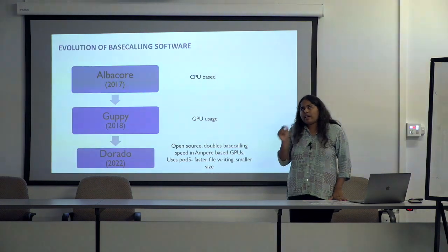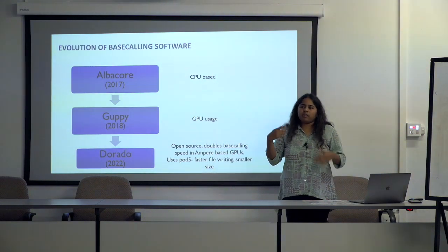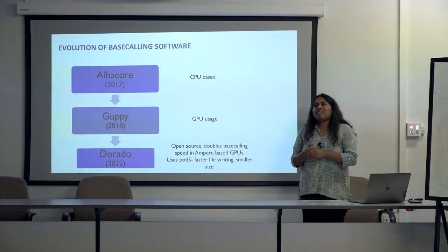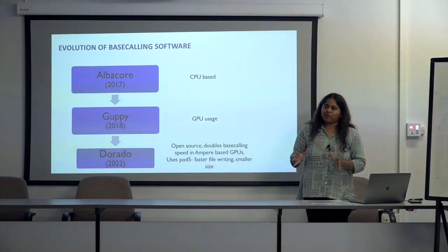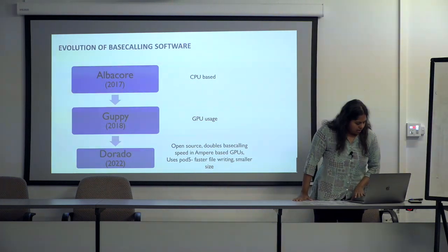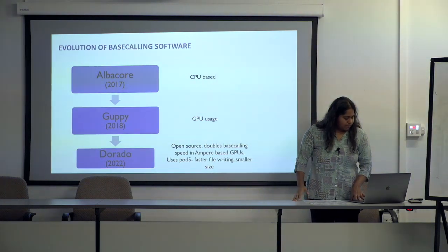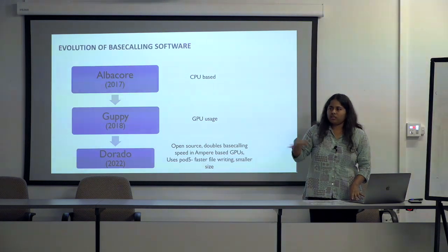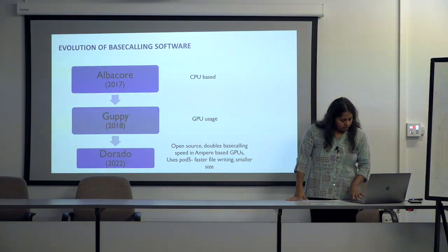The main challenge we had was that a CUDA driver needed to be upgraded. So if you've bought the right computer and things are not working, usually it's a driver-related upgrade that you need to do. They have a toolkit that should take care of it, so we just downloaded that, installed it, and it worked fine.